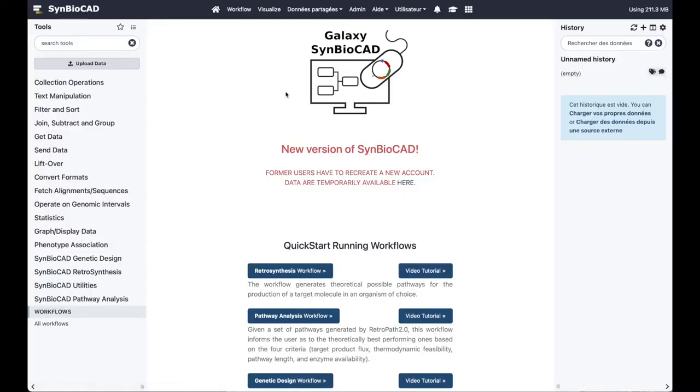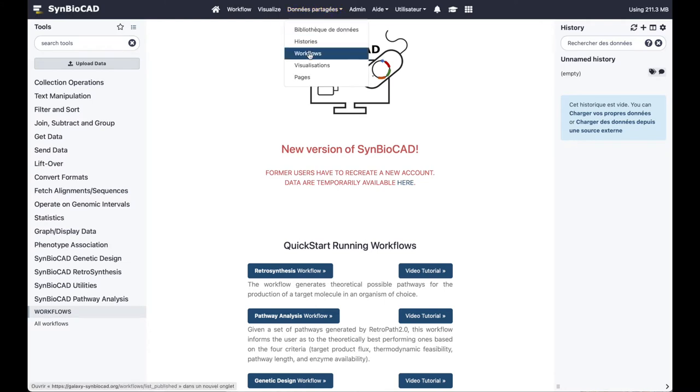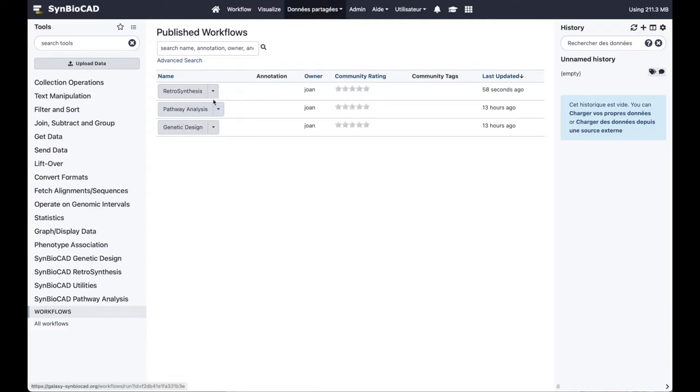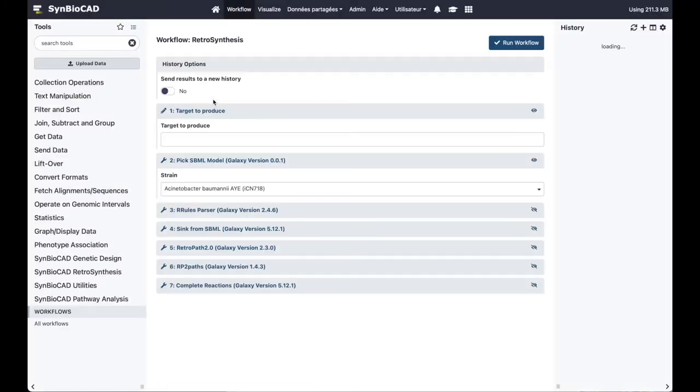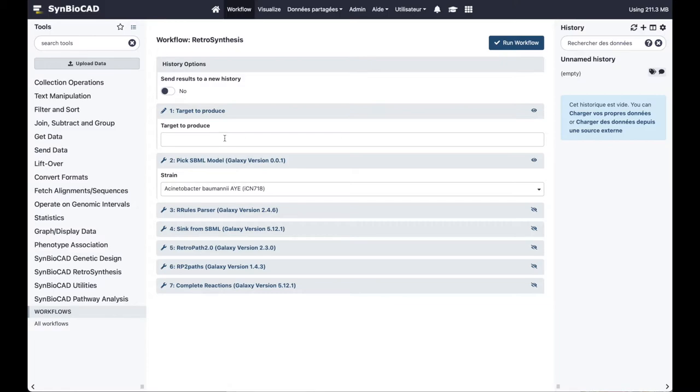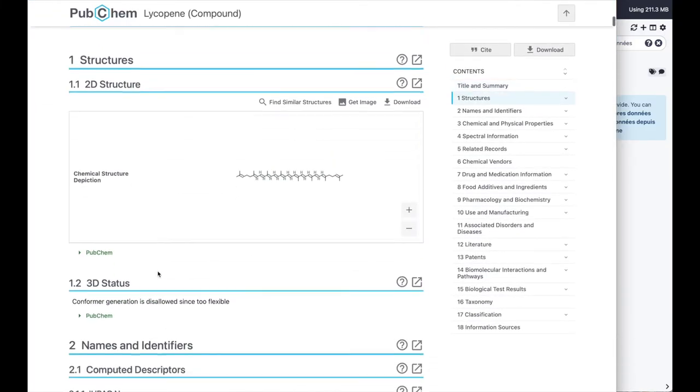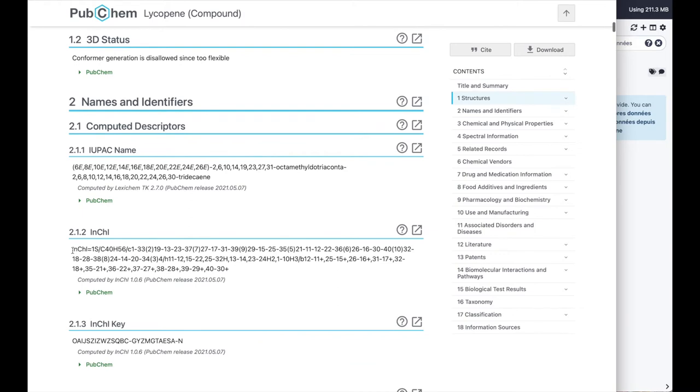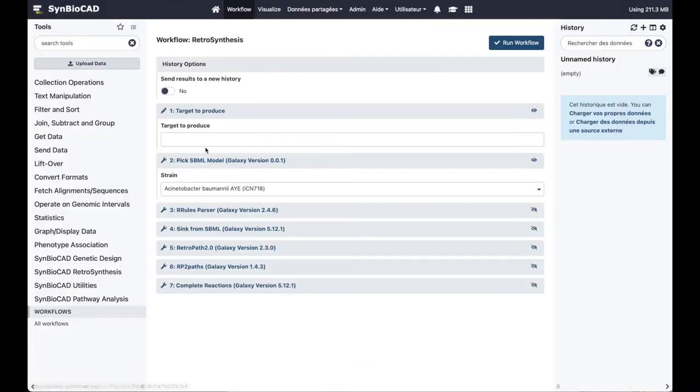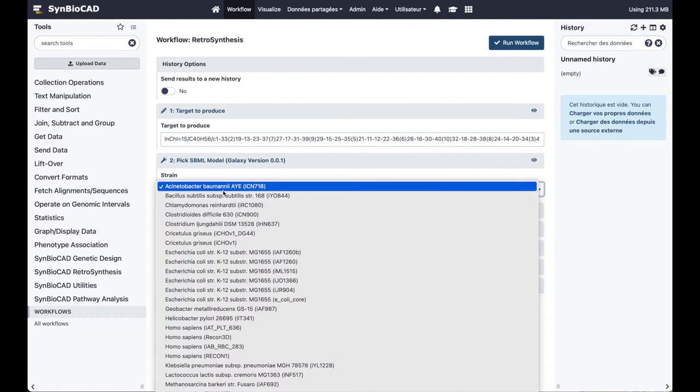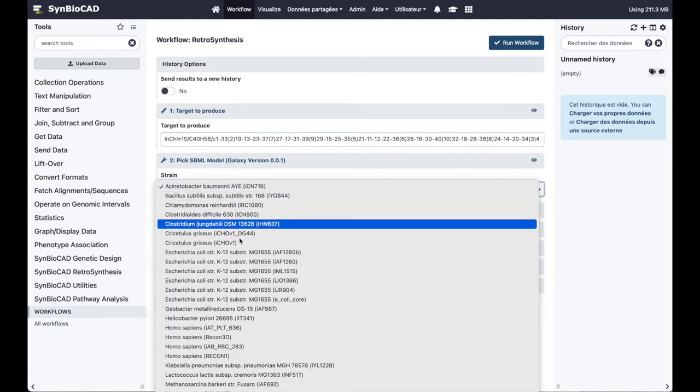To run the retrosynthesis workflow, go to share data menu and select workflows, then choose retrosynthesis, click on it and choose run. Now we can set inputs for the workflow. We choose here to produce lycopene. We fetch its InChI online and put it in the dedicated location. Then we choose the strain where we want to produce the lycopene from.